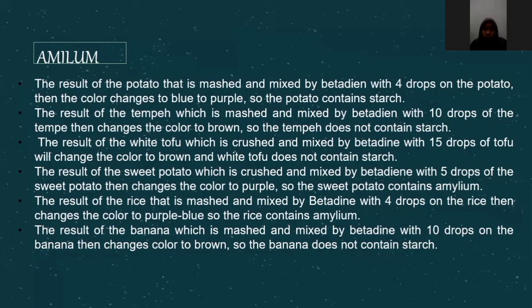Third, the white tofu, which is crushed and mixed with 15 drops of betadine, changed the color to brown, so tofu does not contain starch. Fourth, the sweet potato, which is crushed and mixed with 5 drops of betadine, changed the color to purple, so the sweet potato contains amylum.